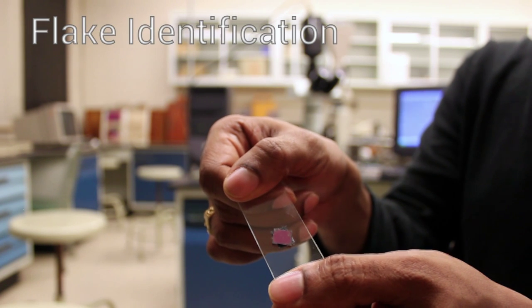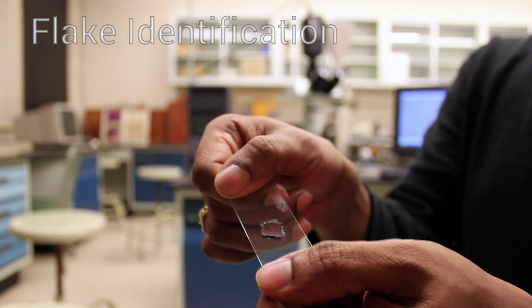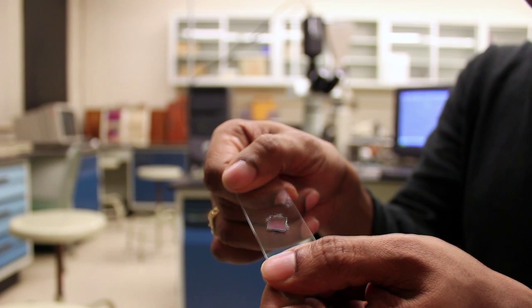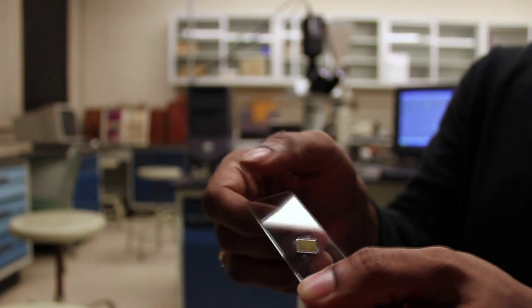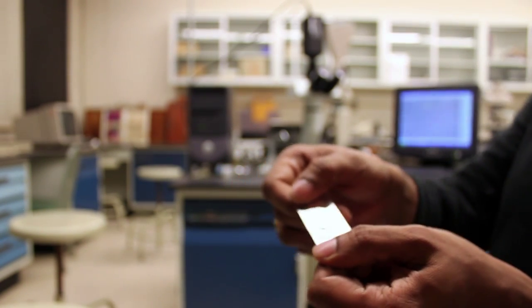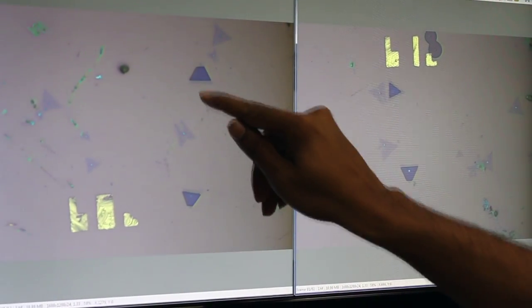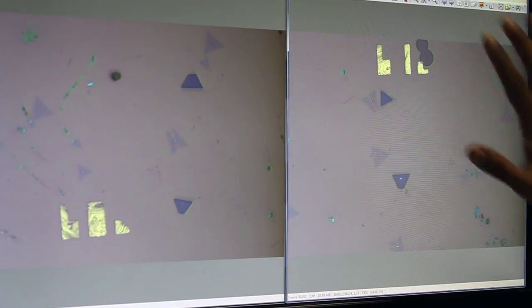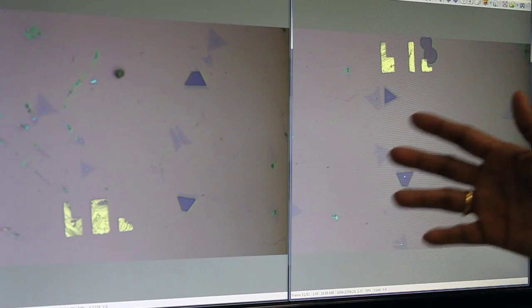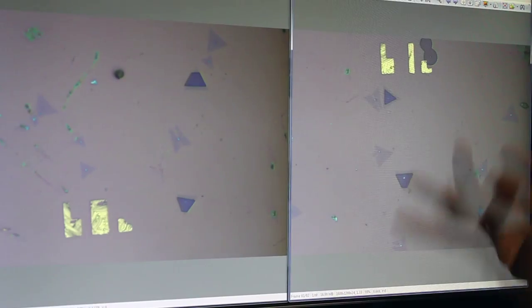This is the sample on which we have the MoS2 flakes transferred — these are CVD MoS2 flakes. We're going to convert areas of these flakes from the 2H to the 1T phase. The sample is covered with polymer and we patterned the areas we want to convert. In the optical microscope images, the whole sample is covered with PMMA and only the regions to be converted to 1T are exposed. We are going to work on these two sets of flakes where the polymer has been selectively removed.